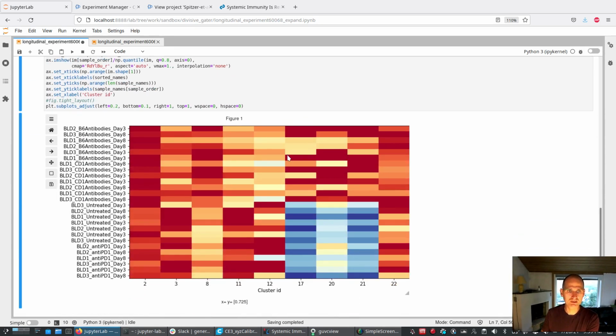I will only say that if I take a cluster and a file, then I can ask how many of the total events are both in that cluster and in that file. That gives me a table of numbers. And these numbers have been used to produce this image. But I have done something to the numbers.